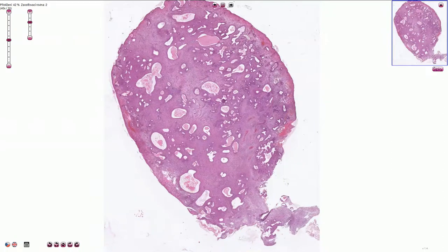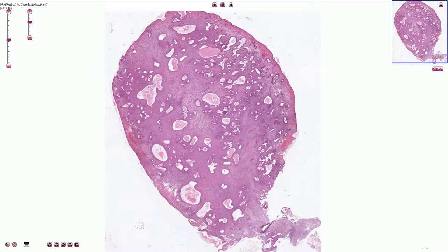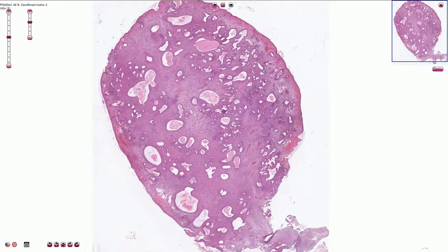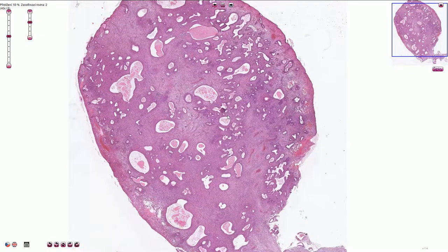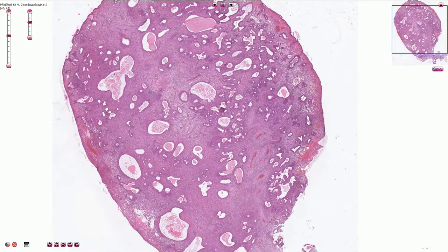Endometrial corporal polyp is a benign polypoid lesion caused by abnormal proliferation of the endometrial stroma associated with glands and medium to large thick-walled blood vessels.